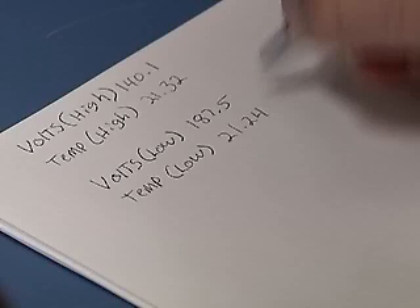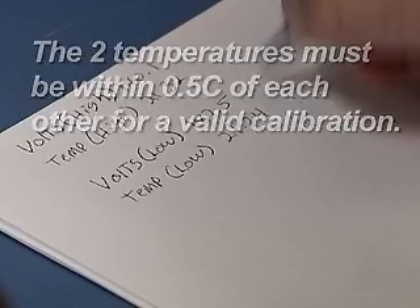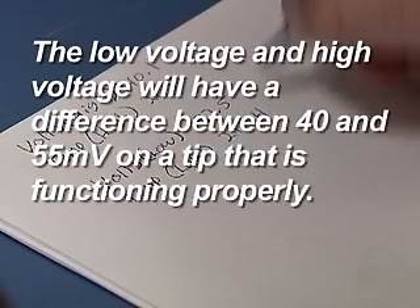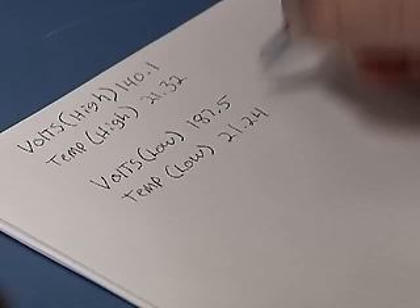A calibration successful message will appear. Record the temperature and the voltage reading. The two temperatures must be within 0.5 degrees centigrade of each other for a valid calibration. The low voltage and high voltage will have a difference between 40 and 55 millivolts on a tip that is functioning properly. This gap will shrink as the sensor tip ages and becomes less sensitive. If it falls outside the 40 to 55 millivolt range, it is time to replace the tip.